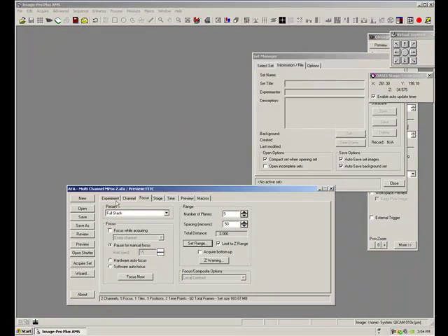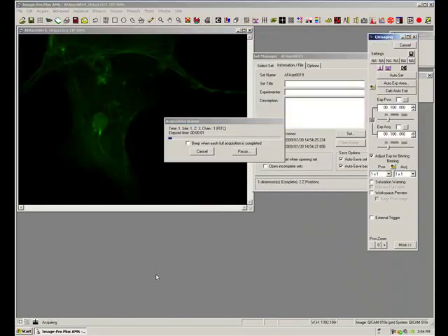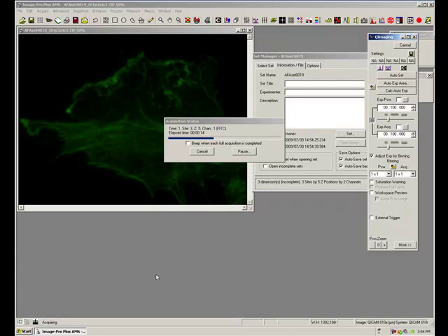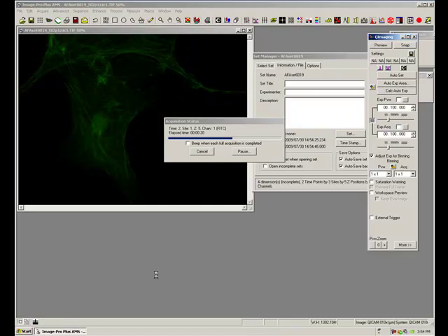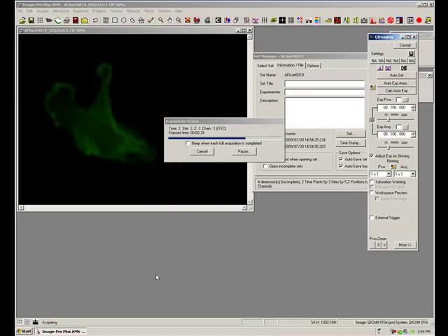Okay. And now I can just acquire. And this is a whole experiment now acquiring. So the first image is pretty straightforward. One thing you'll see is AFA will go and get a black image first. That's actually just setting up the workspace so it knows where to put the images. It's pretty neat. It helps save stuff as well. It looks like that one was a little bit brighter than I thought. We can also have it auto expose each time as well.